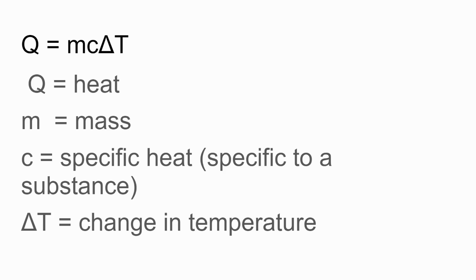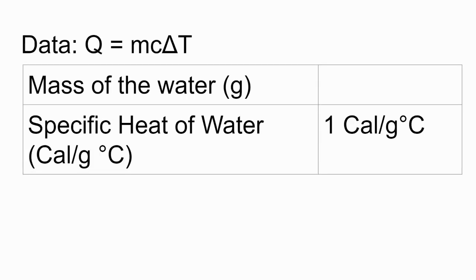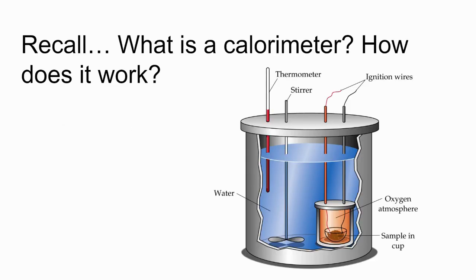Okay. All right, so this is going to be the chamber that we burn some food in. So just like we have our sample chamber, this is going to be our sample chamber. Okay, but there's lots of oxygen in the air to burn our sample, and then you also need a sample holder. So don't throw this away when you're done. We're going to use this probably next year. So this gives us a place to put your piece of food on the top. That makes it so air can move around your piece of food and burn it pretty easily.